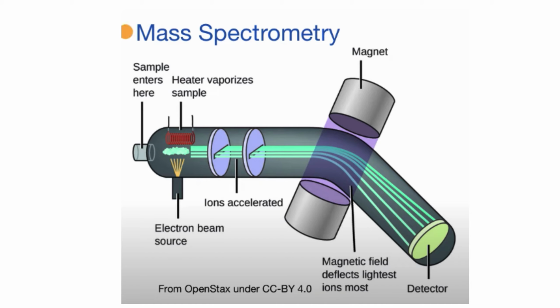After the compounds leave the GC column, they enter the mass spec detector. And the mass spectrometer passes a high energy beam of electrons through each compound, knocking off electrons in the compounds and producing ionized fragments, usually with a +1 charge. And these fragments vary in size.